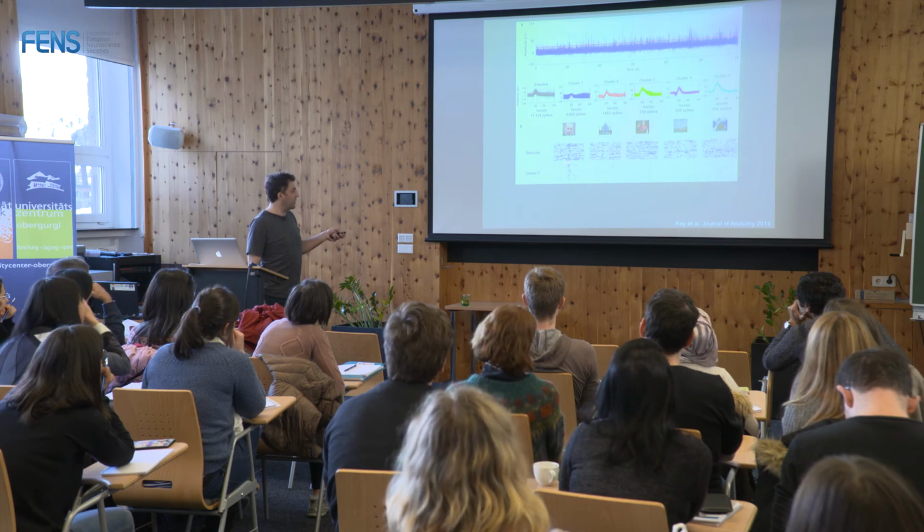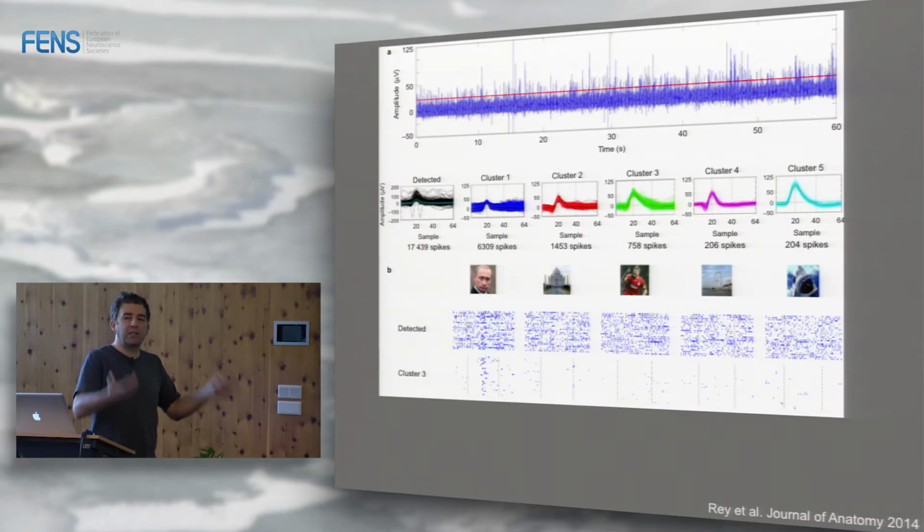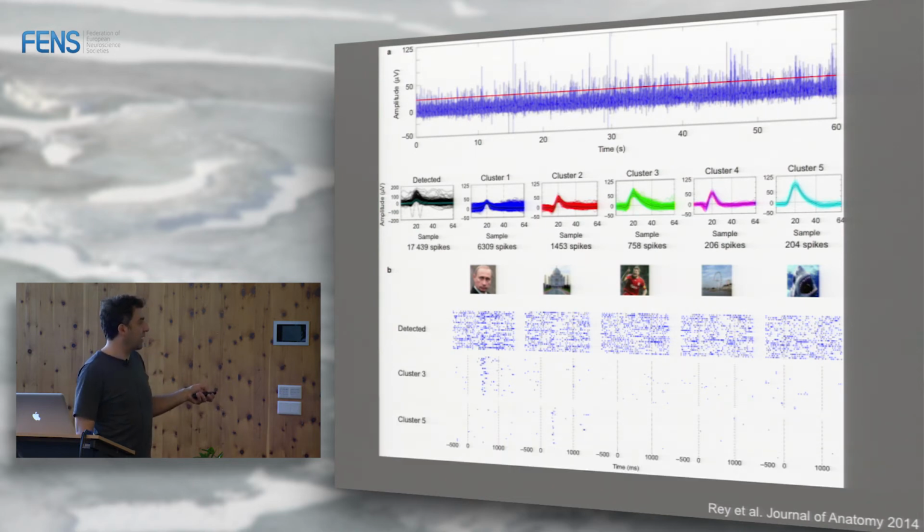Now, if you put these spikes in here, they are actually in here, you don't see anything. You can use any statistical criteria you want. We did. There's nothing significant here. If you see this neuron here, look at this. It fires very strongly to the Taj Mahal, but it's extremely sparse. This neuron is nearly silent, and at the moment we show the Taj Mahal, it fires.